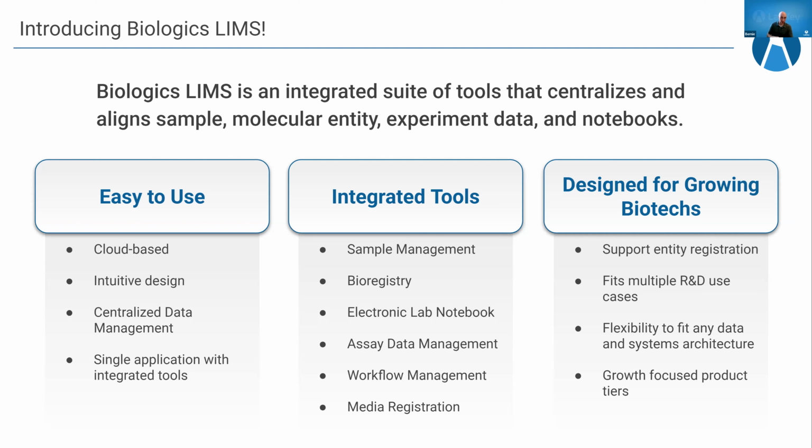I'm going to briefly show you this image again, which many of you saw yesterday from our LabKey presenters. The concept I want to emphasize here, which was also emphasized by our CEO yesterday, is that you can grow with LabKey. I just finished outlining those Biologics LIMS tiers, and they provide a seamless path up through that powerful tooling available in Sample Manager that Hannah walked through yesterday.